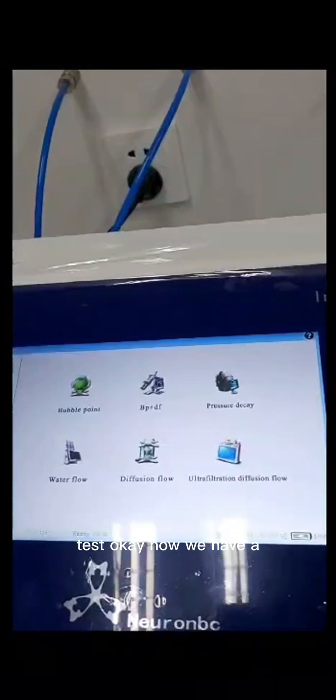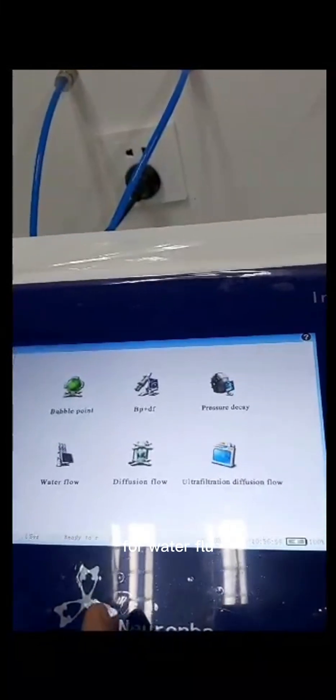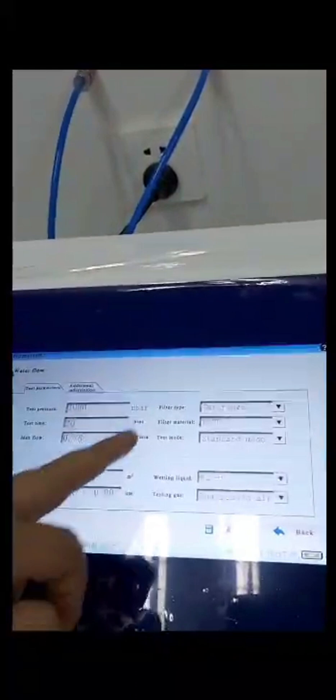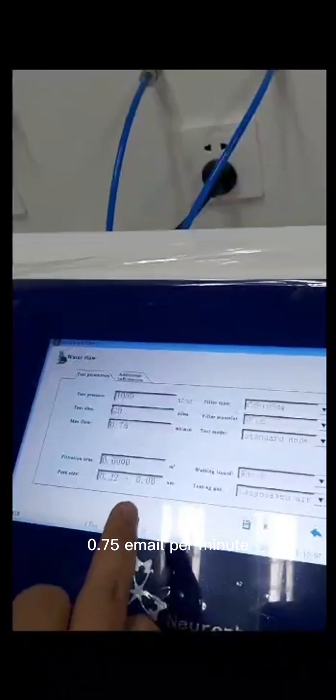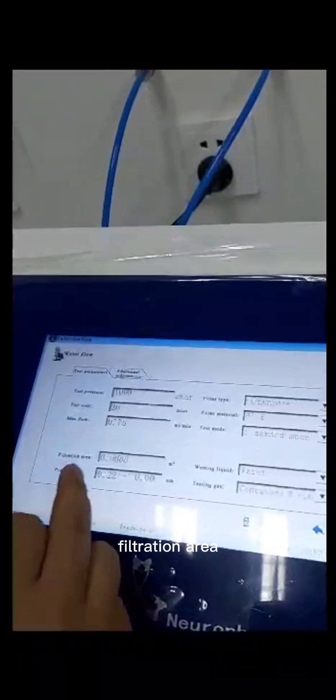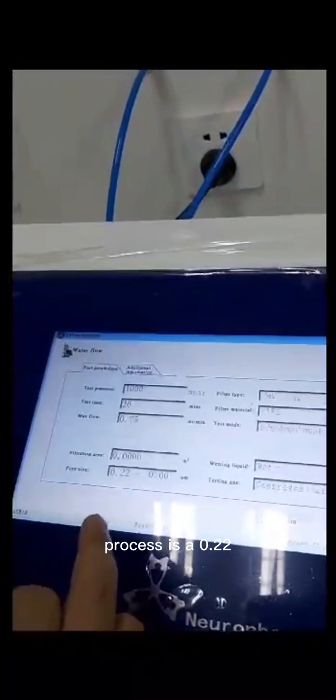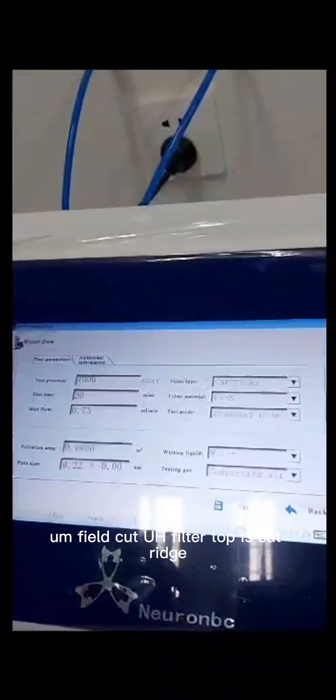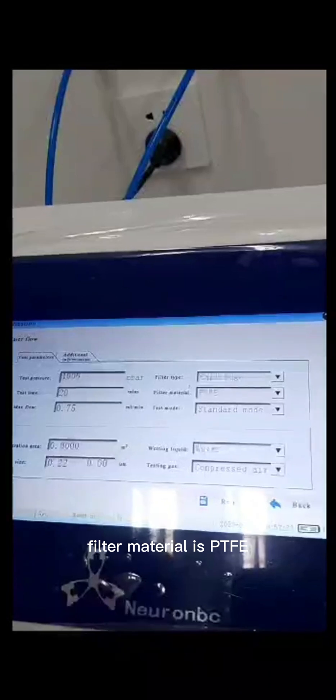Now we have the test for water flow. Water flow. That's the test pressure is 1000 mbar. Test time is 20 minutes. Max flow is 0.75 ml per minute. And the filtration area, 0.6 square meters. Pore size is 0.22 µm. Filter type is cartridge.